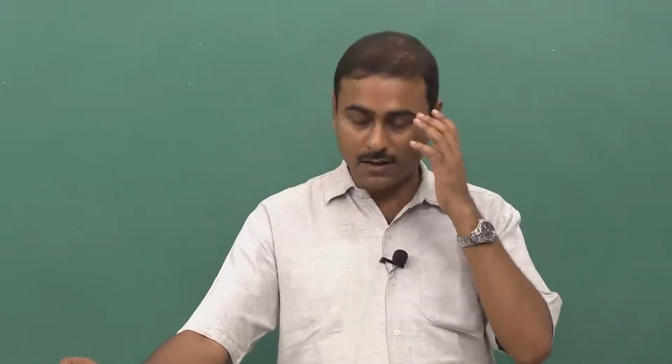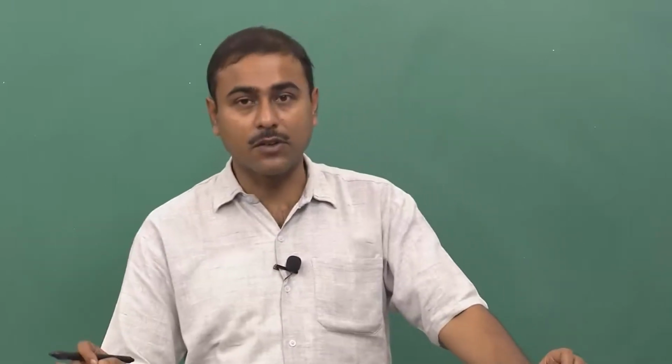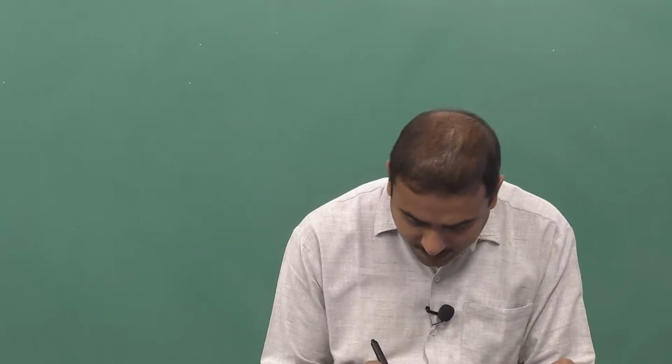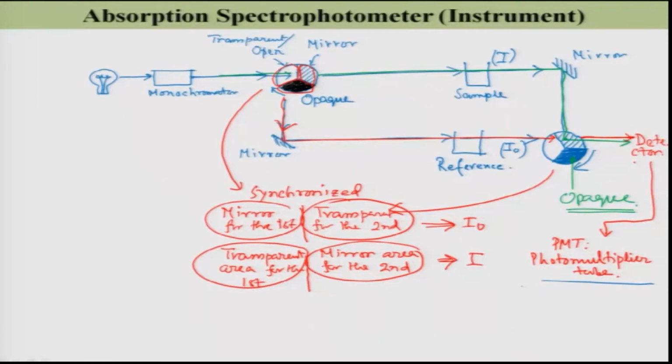This signal from the PMT is always present, and it is called the thermal noise of the PMT. So the PMT always has thermal electrons giving you thermal noise.